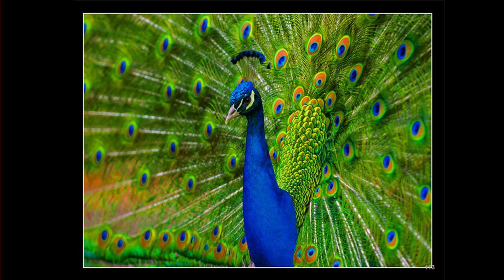These kinds of structures are not only used in filters and mirrors, but actually some reflection from some animals comes from these thin film structures. For example, the peacock here, the very, very bright colors in its feathers come from thin layers where you have these sort of interference filters. This is different from paint.